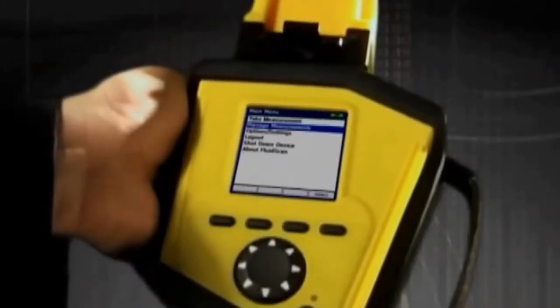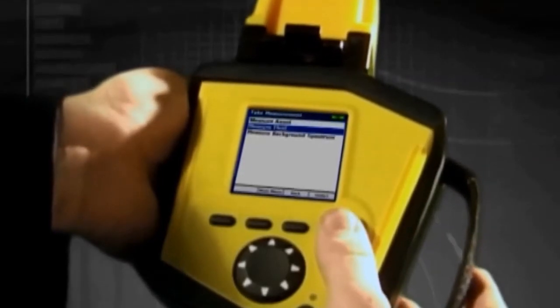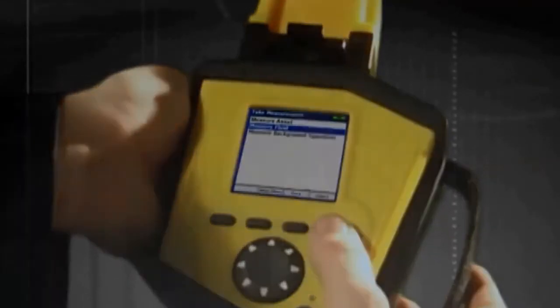Sample analysis is simple and the entire process from loading an oil sample to obtaining analytical results takes less than one minute. A user follows these steps.